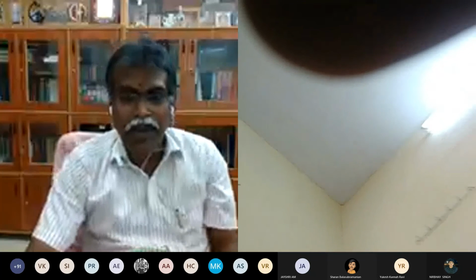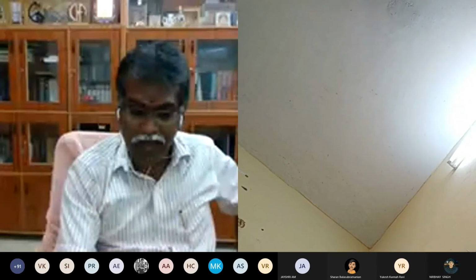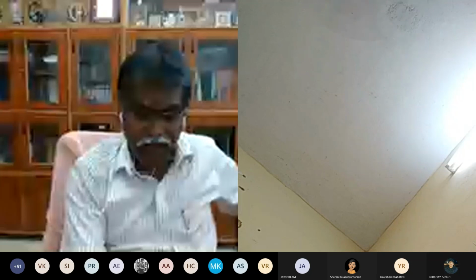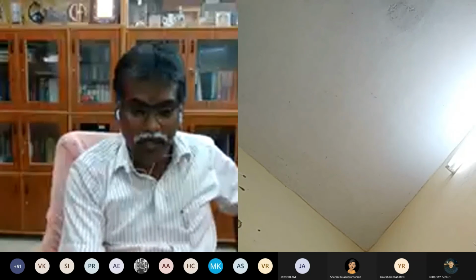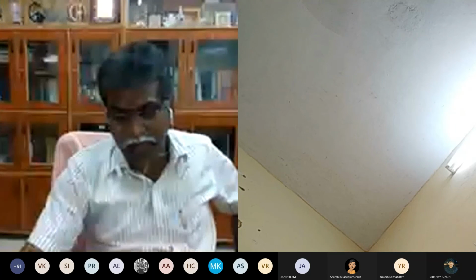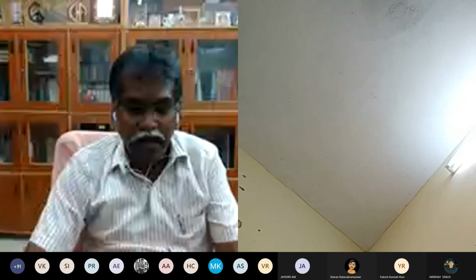Okay. So these are the typical turbidity meters available in the laboratories. This is what I told you, the cuvette bottle. This is your turbidity meter, and turbidity meters are now also available as handheld ones. It's very easy to carry and a very small instrument. Okay. So these are the cuvettes. And you may take a standard solution and also distilled water, place them and make it 0 and make it your standard NTU value, and once it is calibrated, you can take out the sample. You can measure the turbidity for n number of measurements. Is it okay? Yes, sir. So this will cover the turbidity.